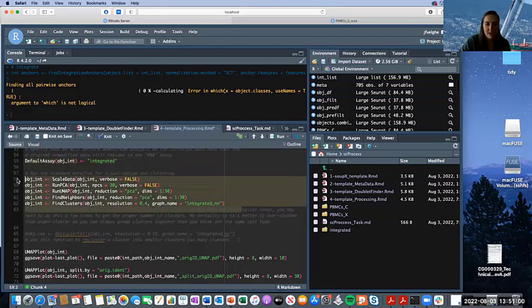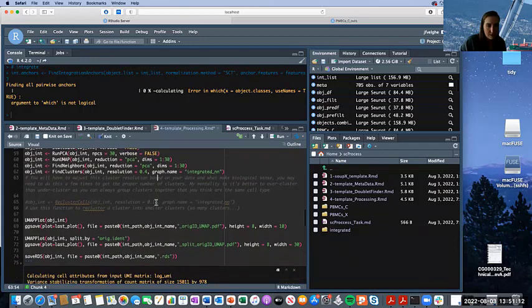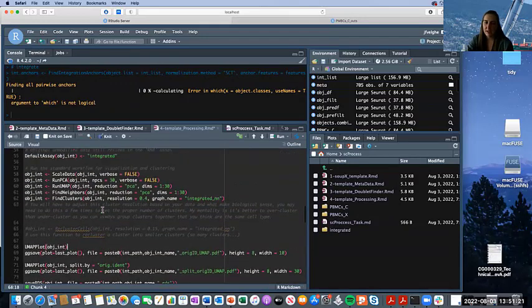These are pretty standard. It's going to do its principal components, then also run UMAP. You can also add in the RunTSNE function if you want, although UMAP seems to be a little bit more preferred in this field, and I'm a fan of it. And then you can plot the UMAP, showing basically your data itself.